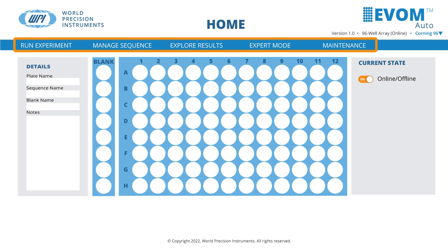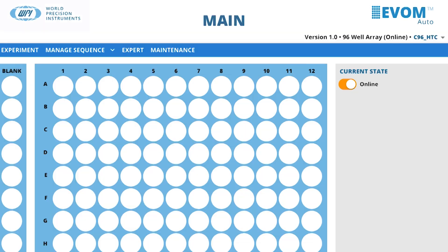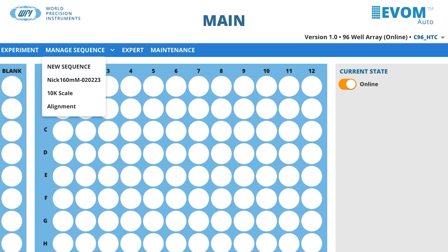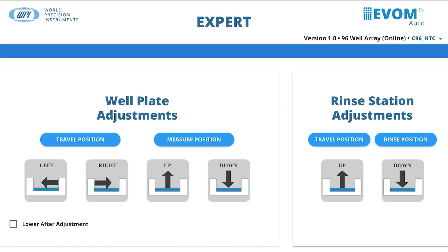The menus let you access all the functionality of the system. The experiment screen contains a representation of the plate and controls to run an experiment. The Manage Sequence button allows you to select a sequence or create a new sequence.